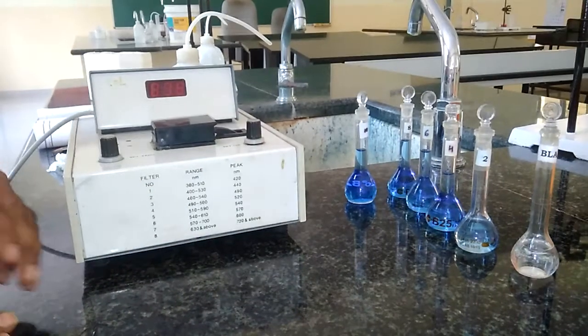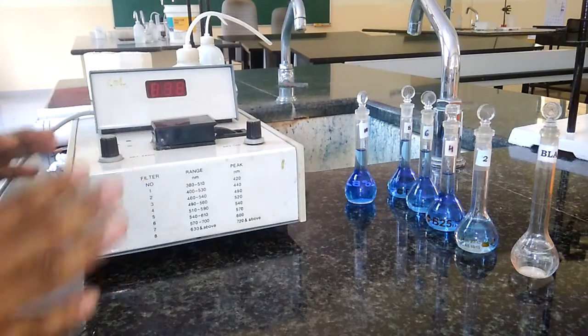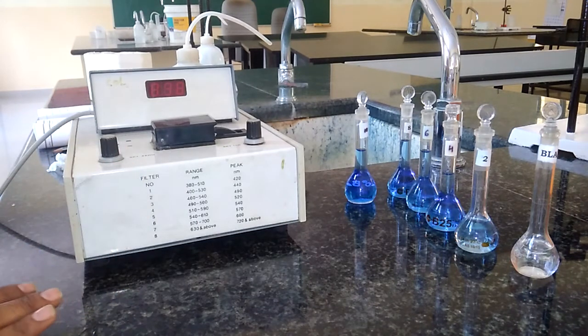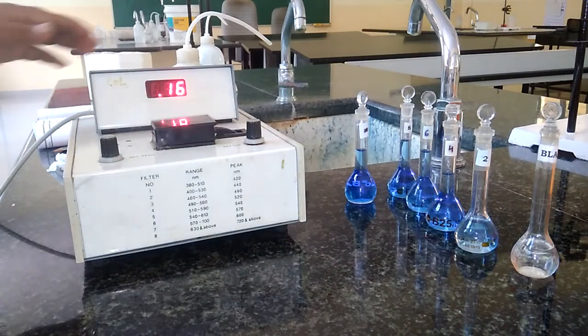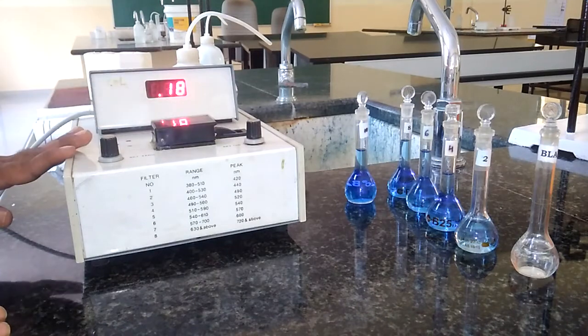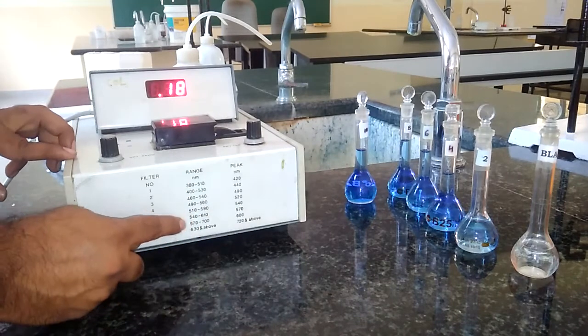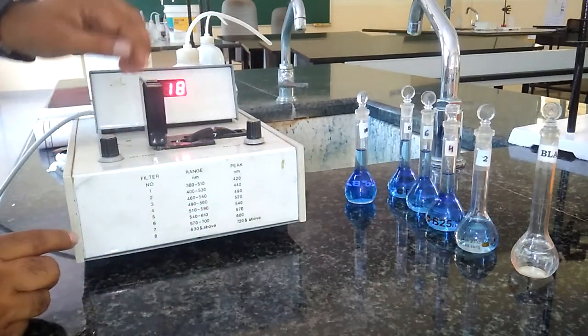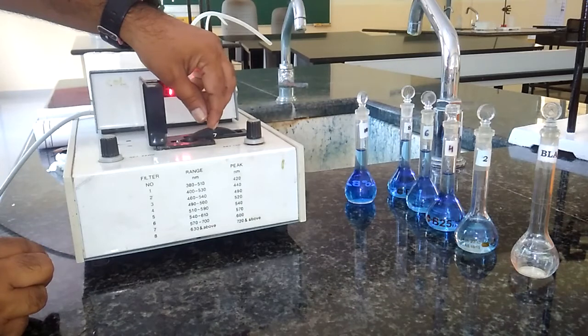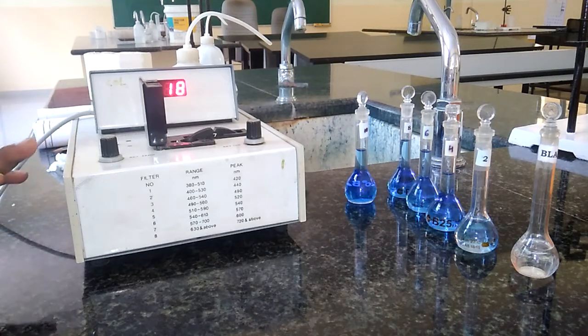These are the sets of standard solutions, blank solution, and test solution. After preparing all of these, let us switch on the instrument called the photoelectric colorimeter. We need to set the wavelength to 620 nanometers. We can see the different filters — at filter number 7, we have 620 nanometers. It is already adjusted to filter number 7, because at 620 nanometers, copper gives the maximum absorbance. That is why 620 nanometers is selected for copper estimation by colorimetry.